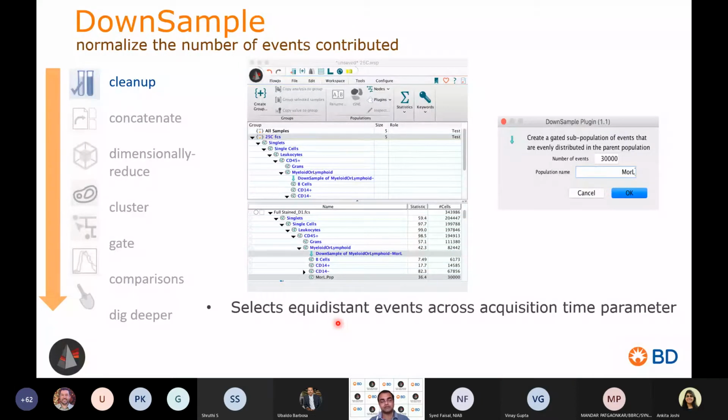But in the version that we are using now, 10.7 today, we can probably omit this step. We can do it at the time of doing concatenation itself. I'll show that.